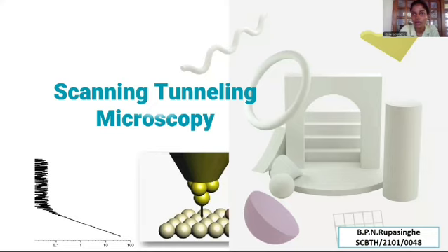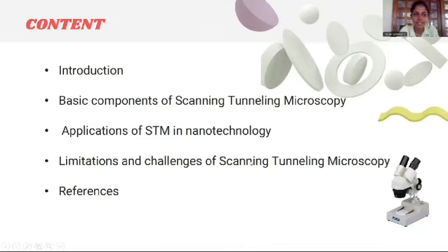Today I am going to talk about scanning tunneling microscopy in nanotechnology. This is my content: introduction, basic components of scanning tunneling microscopy, applications of scanning tunneling microscopy in nanotechnology, limitations and challenges of scanning tunneling microscopy. Finally, I give my references.